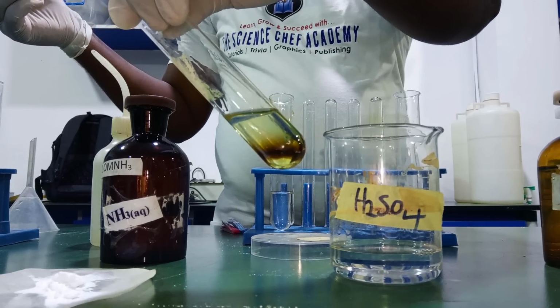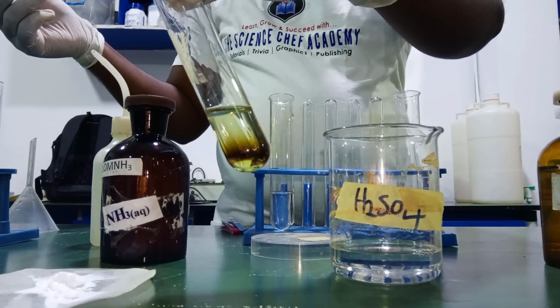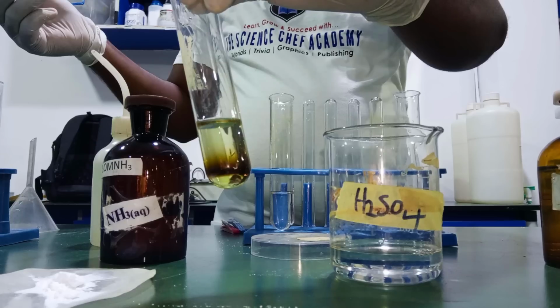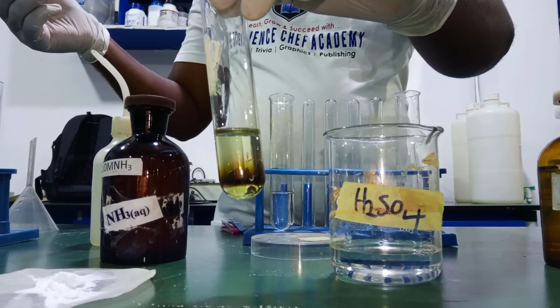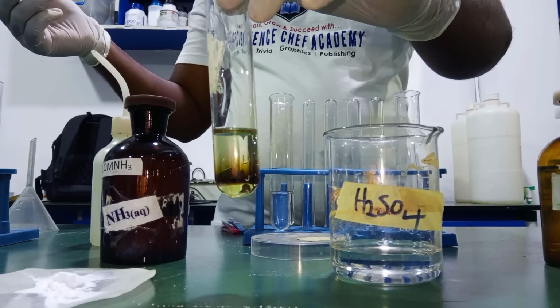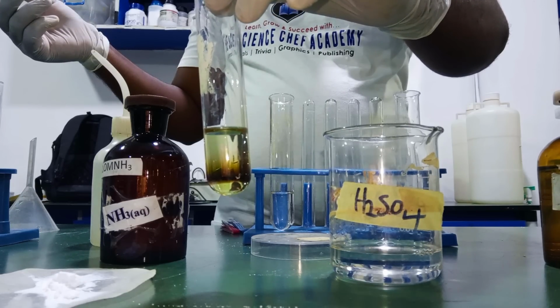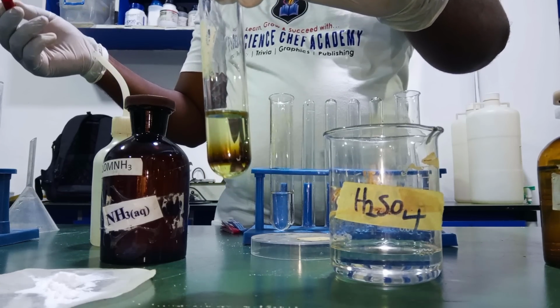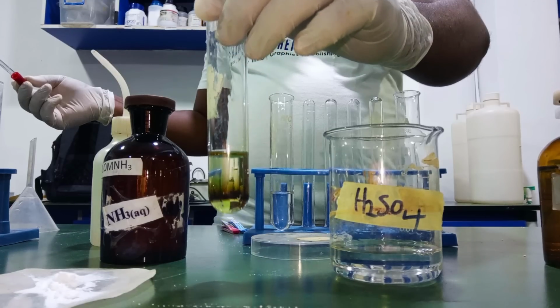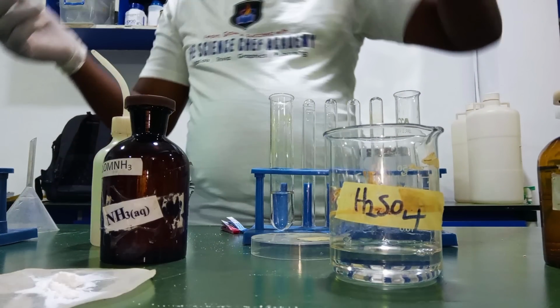Now raise it gently, gently. Wow, this is beautiful. The brown ring forms at the junction of the aqueous and the acid layer. Can you see it? Wonderful. All right. So that confirms the presence of the nitrate ion. Okay. So we are done with that test. So let's drop that and now move on to our residue.